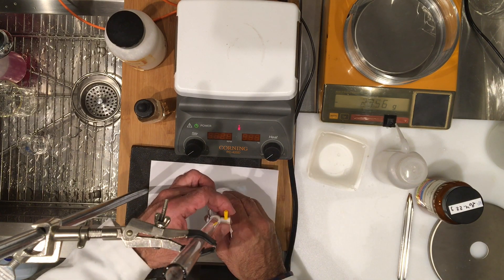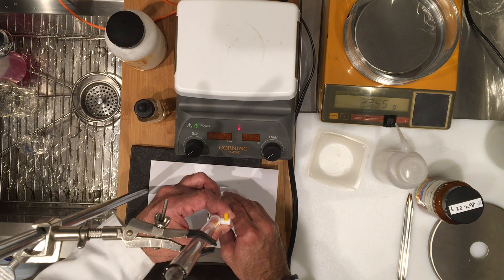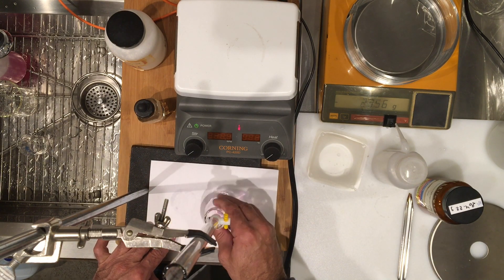So we are close again, so I'm going to add my titrant drop by drop. But I think we are still maybe a milliliter or so away, so it's not super close, but the drops are going relatively fast.